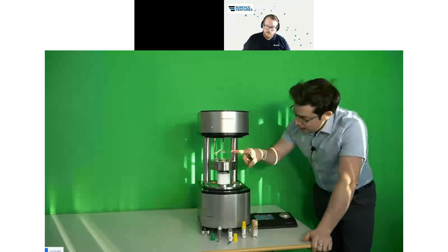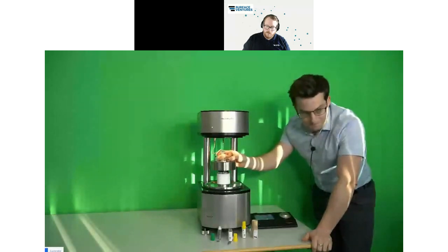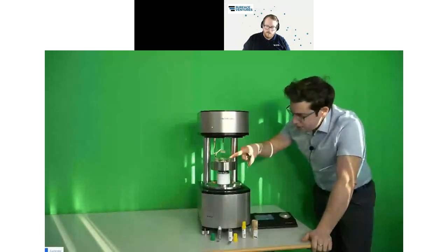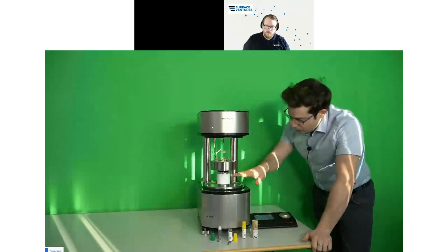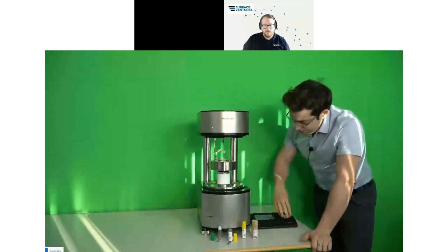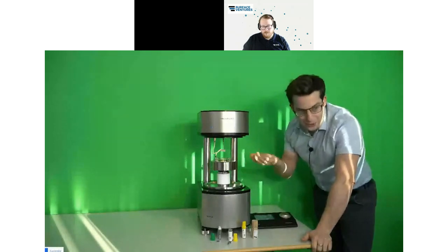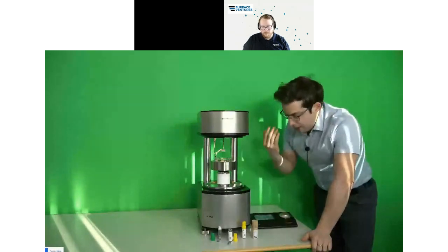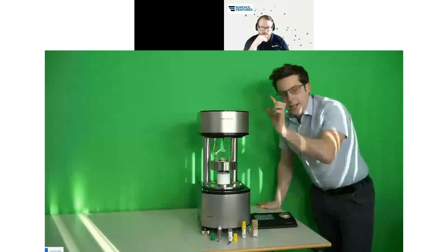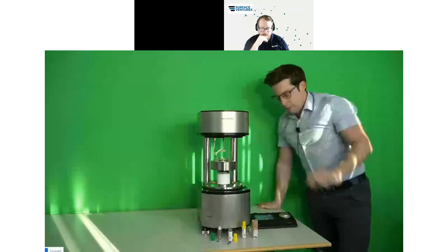Then you see I have a sample vial, and in this sample vial I have water. You have a thermostat jacket to control the temperature of the water very well, and down here in the lower part of the device an automatic sample stage. During the measurement, this sample stage moves up and down, automatically controlled by the software. Like this, you are submerging the plate into the liquid, and then the balance is recording the weight of the water lamella that has attached to the plate.